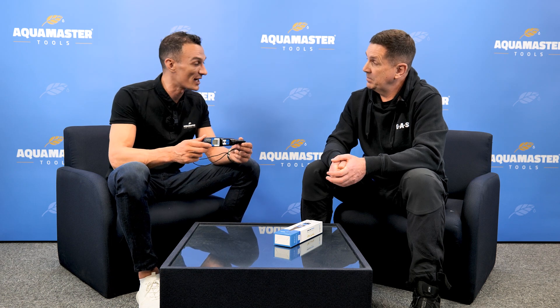It has a nice soft-touch rubber back. You can see all our brand logos in there. We made the design a little bit like the Dyson vacuum cleaner — if you put it on the front, it will roll back to its back automatically. We did a lot of effort on the design, the quality of the product, and the quality of the materials. This is an all-in-one device for every user in any type of industry, made of strong materials with a replaceable probe.